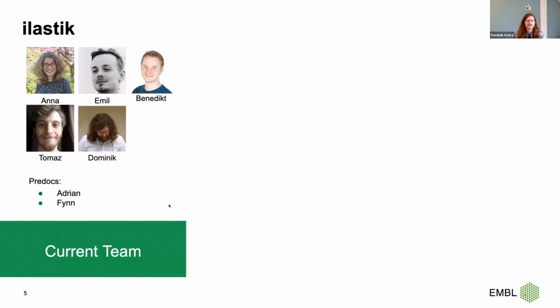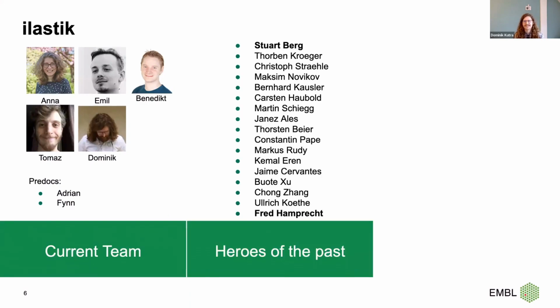But since it's very old, you can probably imagine that there are many people who should be mentioned here who contributed to Ilastik, and I will highlight 2 here. Fred Hamprecht, who hosted the development team and supported it for a long time at the university, and Stuart Berg, the previous core developer of Ilastik.